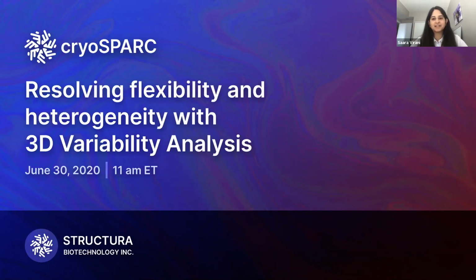Thank you all for attending today's webinar titled Resolving Flexibility and Heterogeneity Analysis with 3D Variability Analysis. This webinar is organized by Structura Biotechnology, the team that builds and supports the cryoSPARC software package for single particle cryo-EM. Today is the first in a series of webinars that we're hoping to offer on various topics related to cryoSPARC and cryo-EM image analysis.